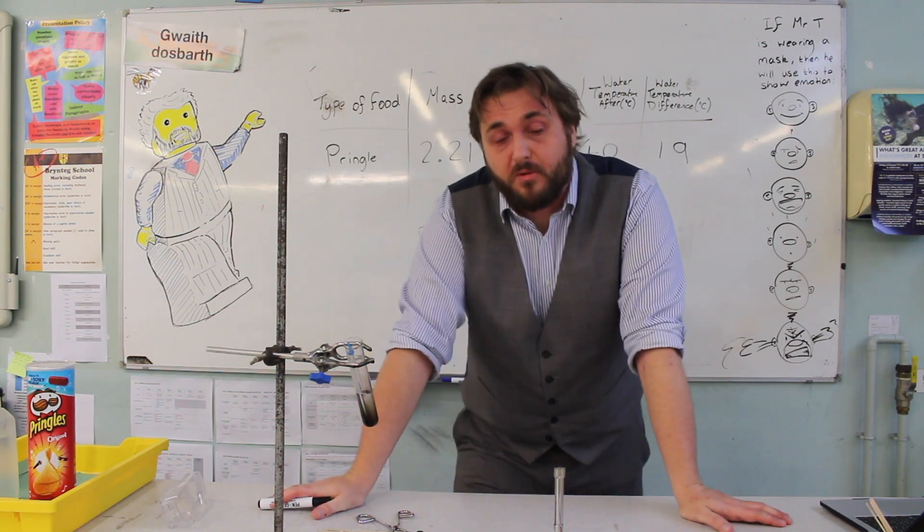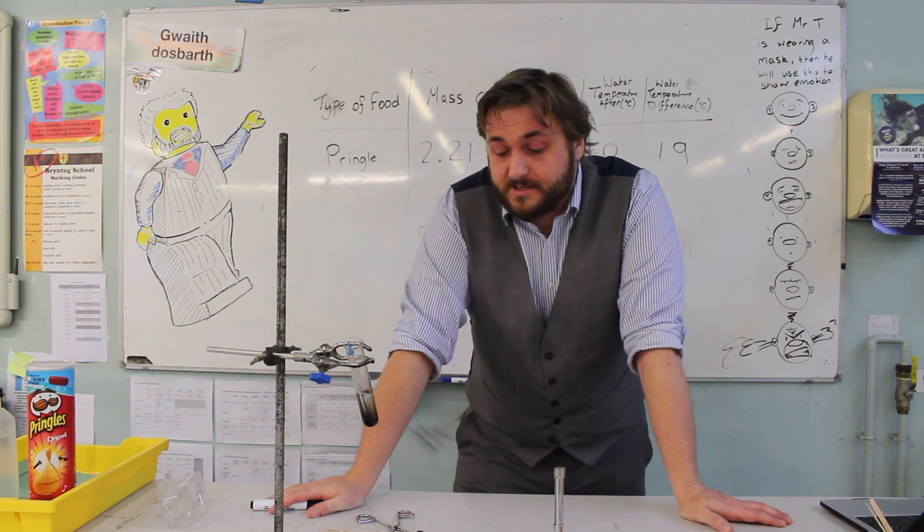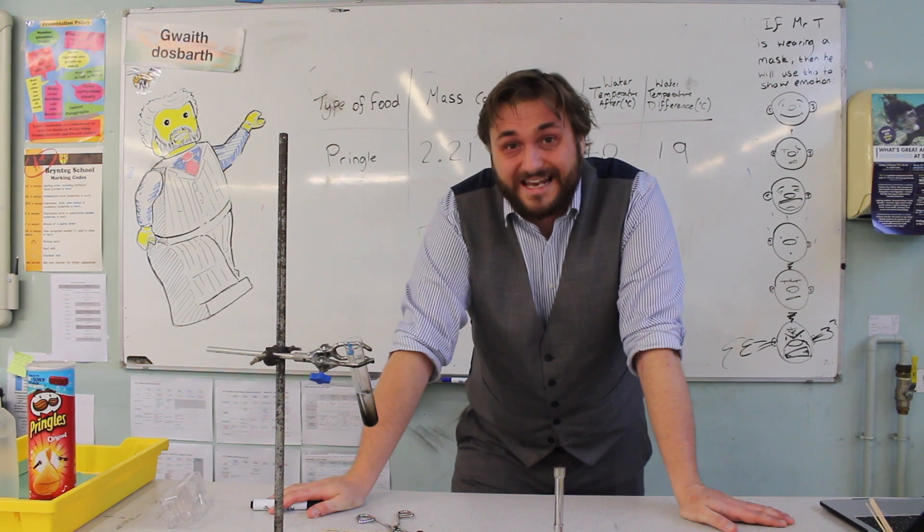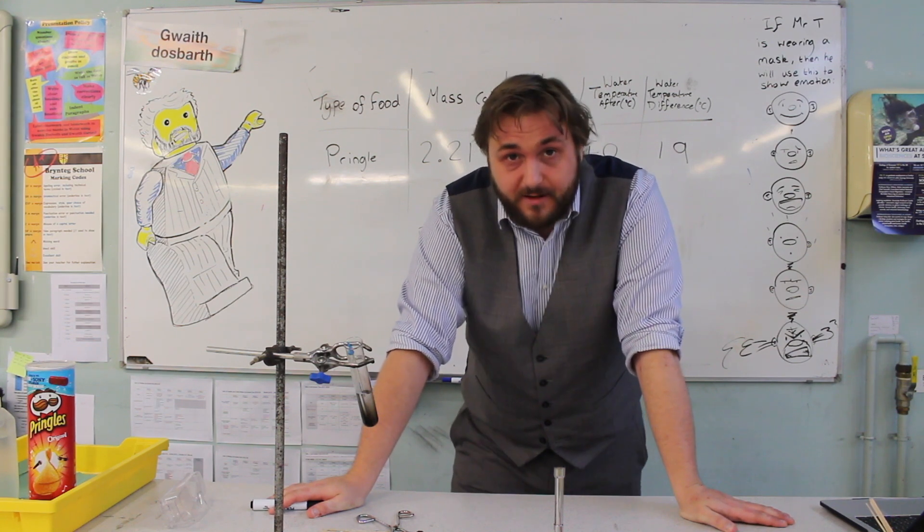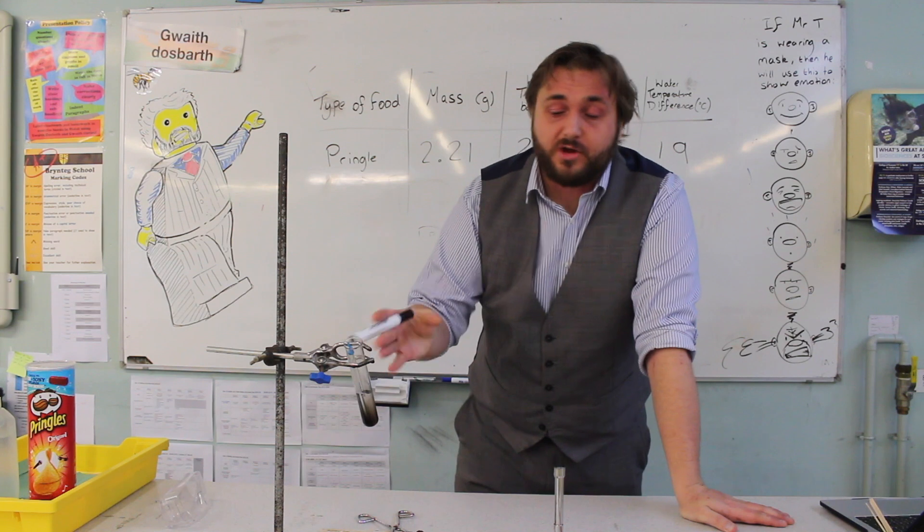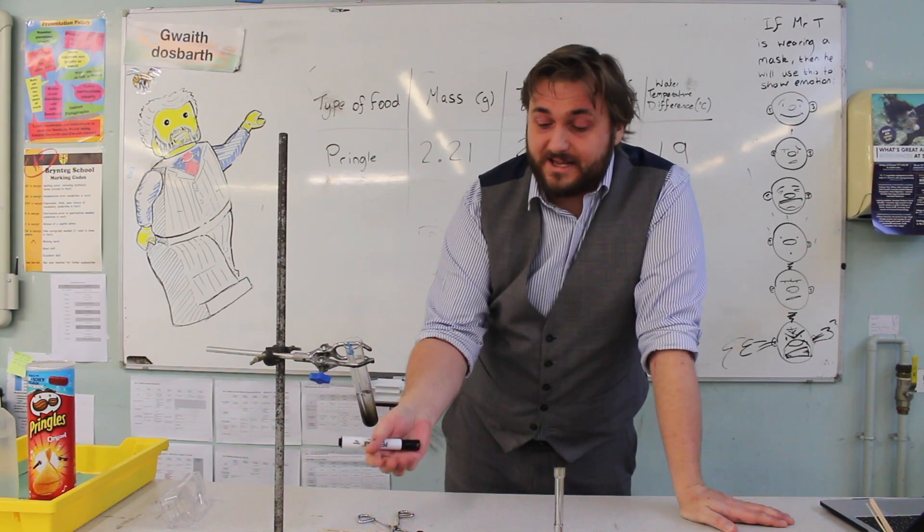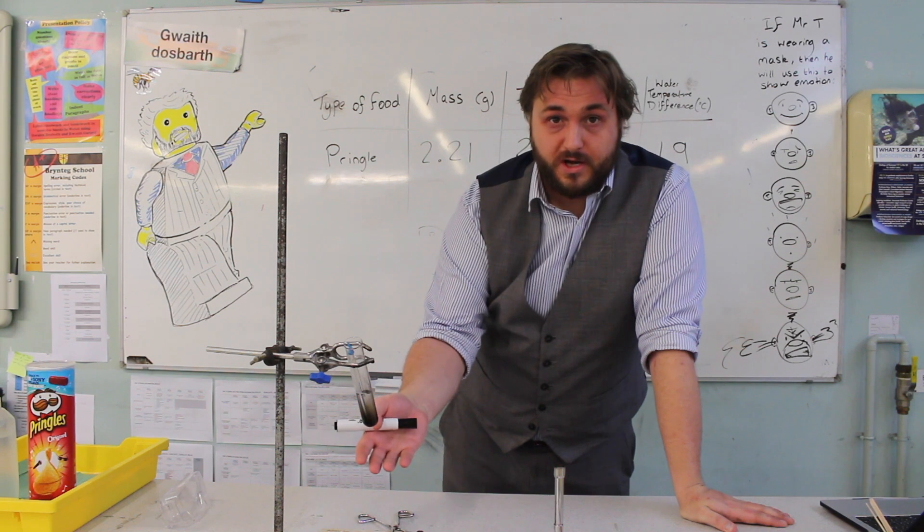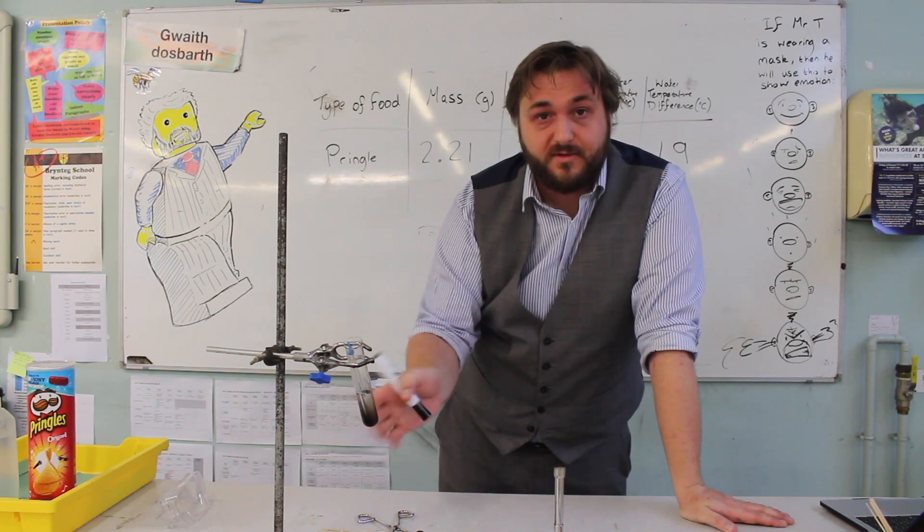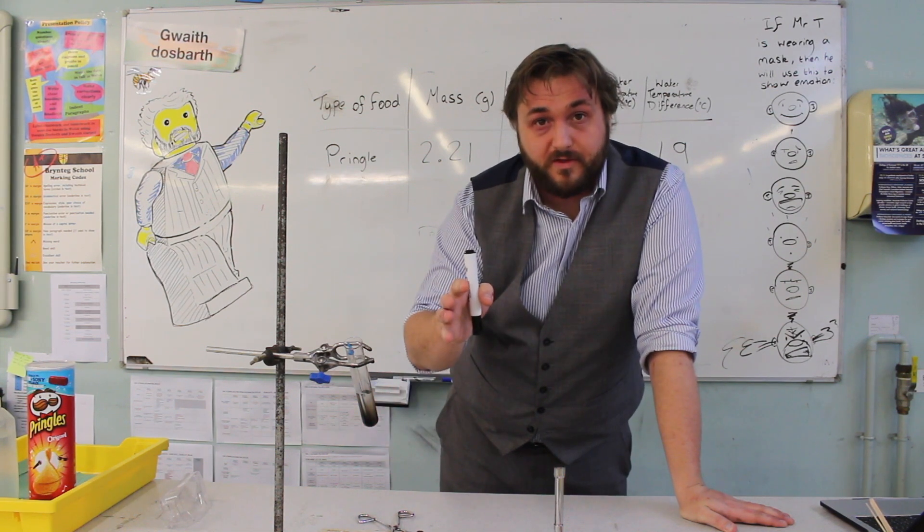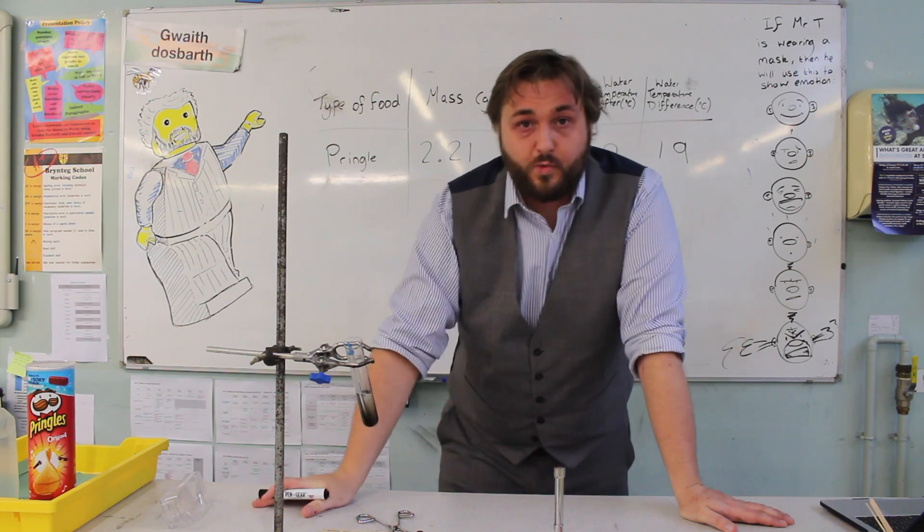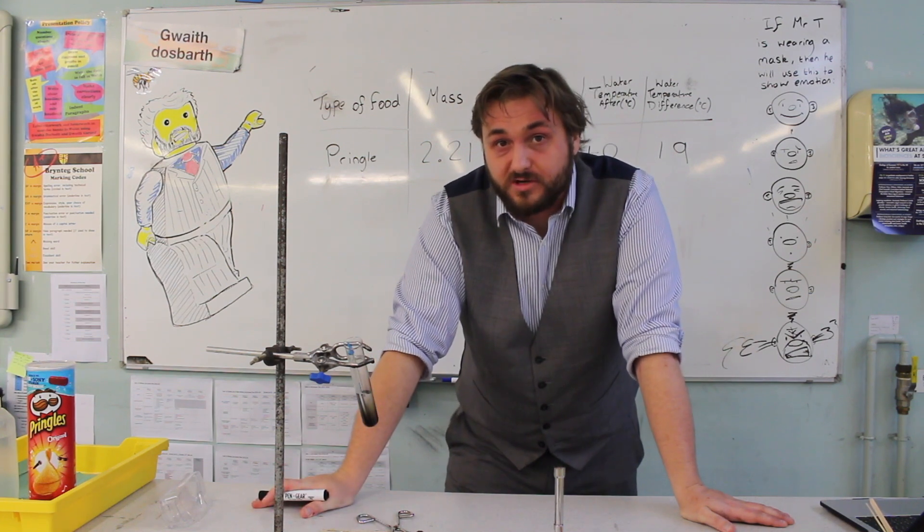There are a few problems with this experiment in that when you've lit a crisp on fire, it's also releasing light energy as we can see the flame. That light energy isn't going into heating up the water, therefore that energy is lost. As well as that, even if you're holding your crisp underneath your boiling tube, some of the heat from the flame is going to go either side of the boiling tube and it's going to miss the water completely, and again that energy is going to be lost.